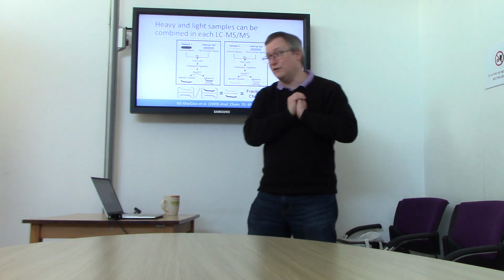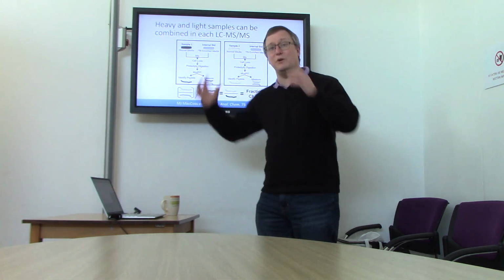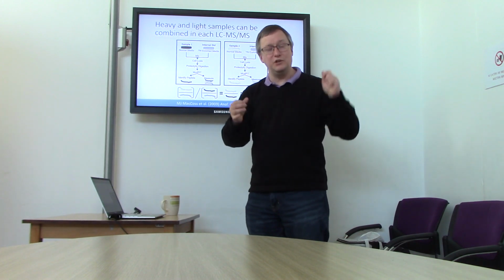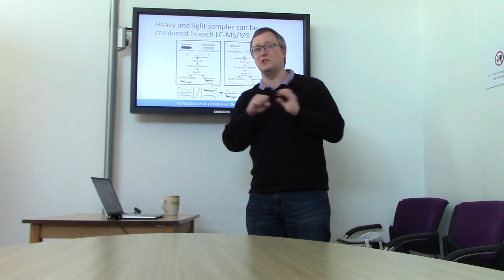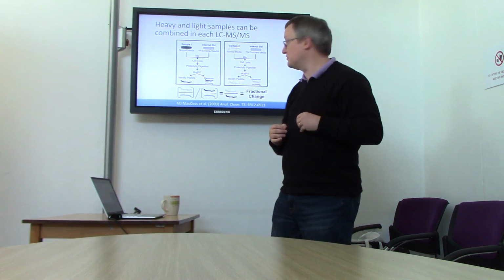So you can see that even if you have far more than 20 samples that you want to compare among, so long as you have a pooled sample carrying a label, you can use the pooled labeled sample as a point of reference for computing all of those.